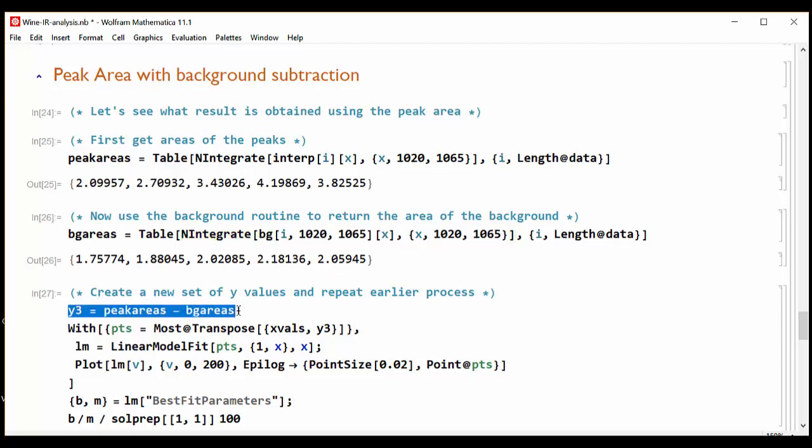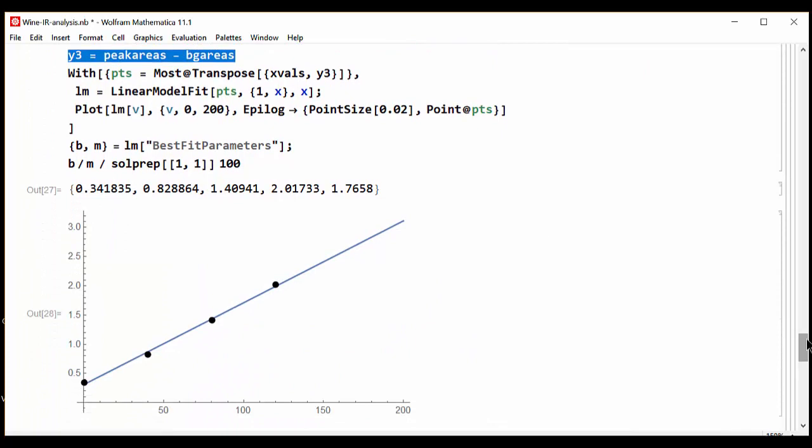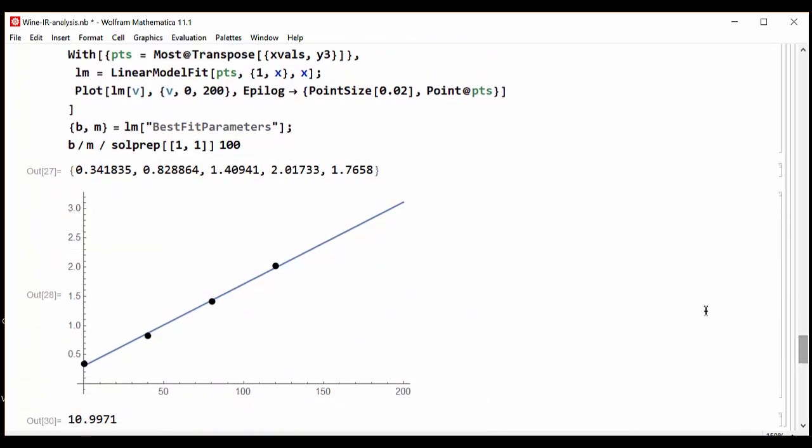Subtracting those two gives us our new set of Y values. Again we crunch the numbers, create a linear model, plot that model, extract the best fit parameters, use the best fit parameters to get a concentration.